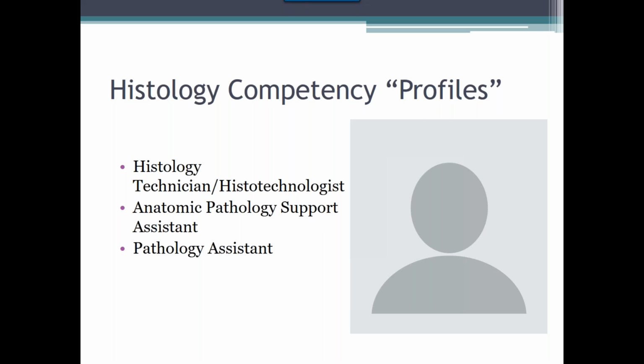Usually it is best to proceed one test system at a time. The process continues by performing the initial competency for each test system. Again, it's best to proceed one test system at a time. So what you basically do then is you train a test system, then competency that test system, train the next test system, and then competency that next test system, and so on and so forth.